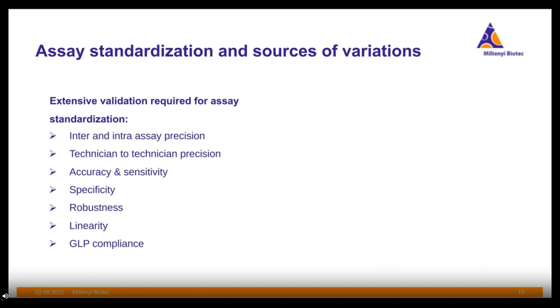One needs to see the robustness, linearity across different times, and of course, even though the studies are non-clinical and it bridges the connection to clinics, some of the assays are also suggested to be done under a GLP environment.